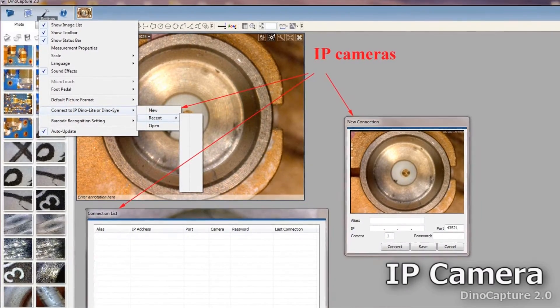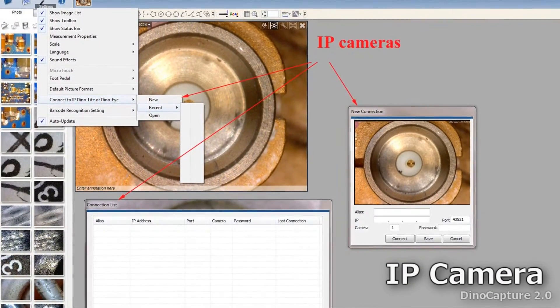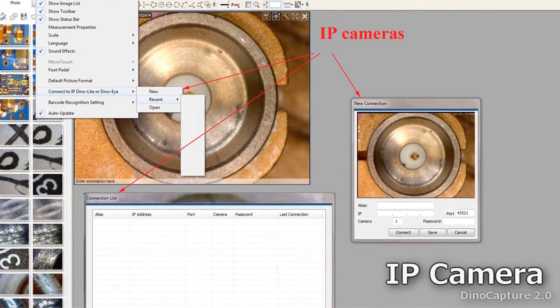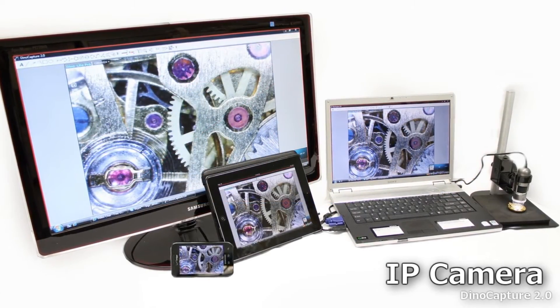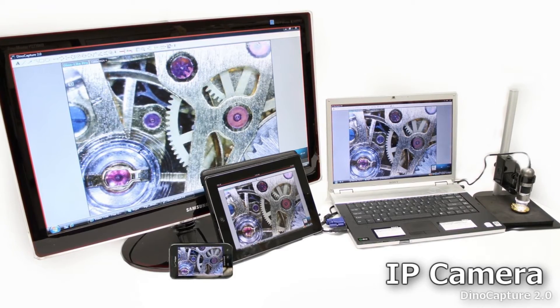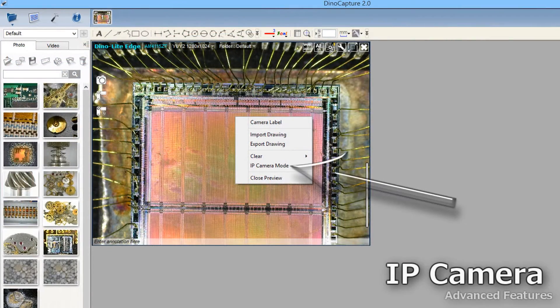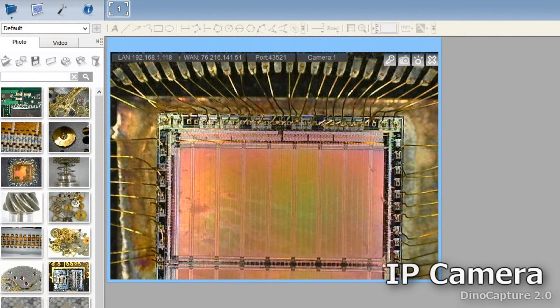You can allow other people to remotely see your DynoLite by switching your live preview window into IP camera mode. This is useful for situations where privacy is needed, as the only way to connect to a remote DynoLite is to know the IP address. To go into IP mode, right click on the live image window and select IP Camera Mode. There are more detailed instructions in the user guide, or you can contact us for more information.